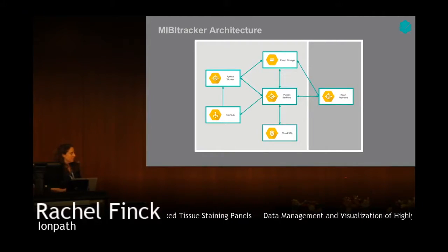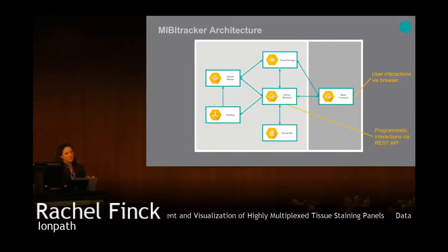We have a browser-based front end, which happens to use the React library. That's where you as a person go and click buttons and move sliders around. And it also allows you, if you're an analyst, a sort of coder, to interact with it and script all of these interactions as well.